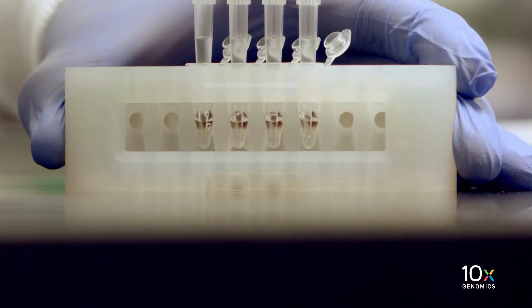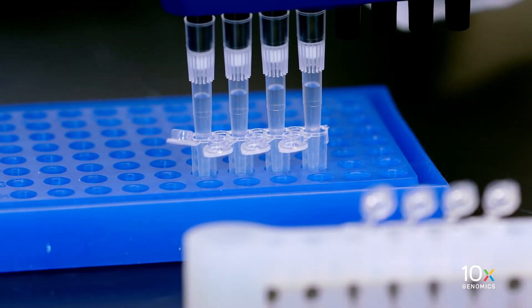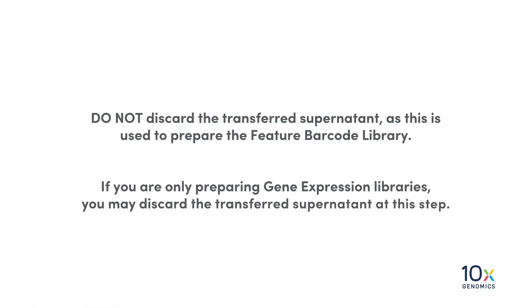Carefully transfer the recommended amount of supernatant to a new tube strip without disturbing the pellet. Please refer to the protocol-specific user guide for details. Do not discard the transferred supernatant, as this is used to prepare the feature barcode library. If you are only preparing gene expression libraries, you may discard the transferred supernatant at this step.